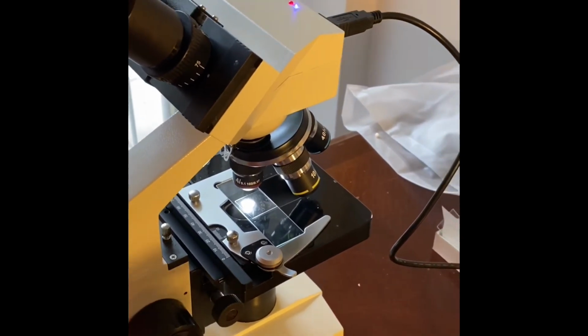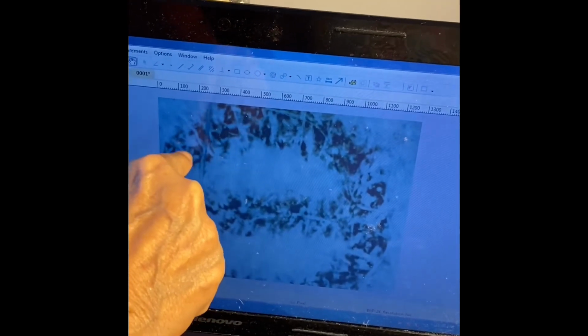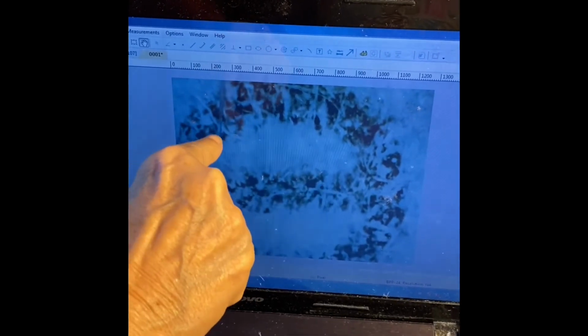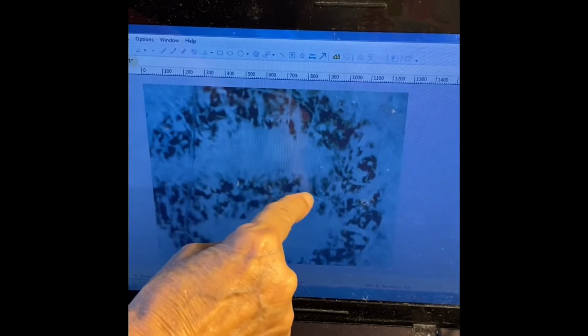Looking at the image, you see that it begins here as upside down, as in an at symbol. You begin here and it goes all the way around like this to the side, to the inside. That's an upside down E.